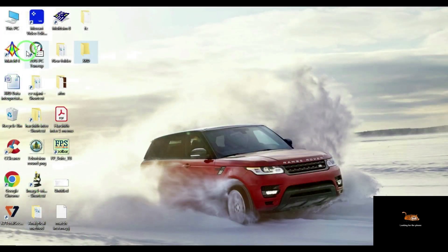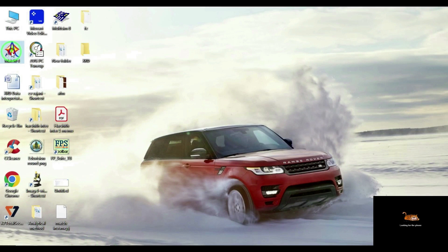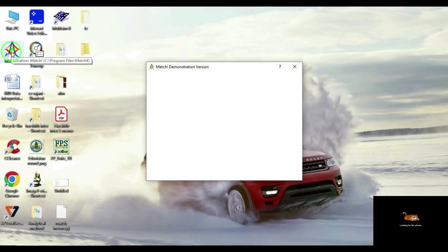Then double-click on the Match phase identification software icon. This will open the software package. Here I have installed the demo evaluation version, which will be available for 60 days only. After 60 days, the program will not be opened or executed, so you have to purchase the package from the official website. Presently I am making use of only the evaluation copy.